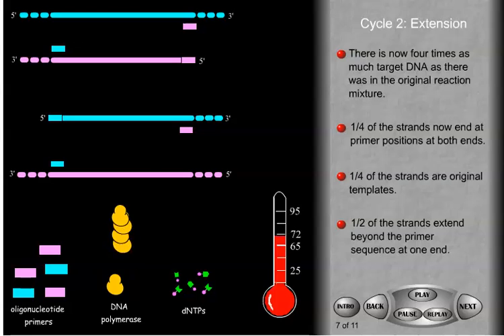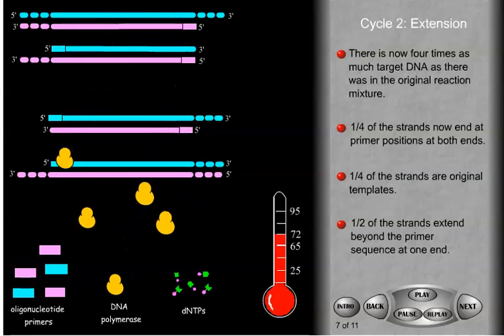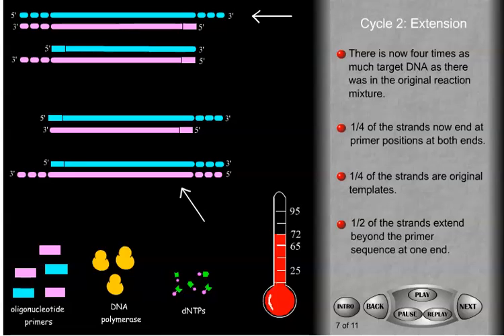With the completion of extension in the second cycle, there is now 4 times as much template DNA as we started with. Although the original template is still present, the majority of the DNA in the reaction has been newly synthesized. Strands which used previously synthesized strands as templates are of defined length, because the polymerase ran out of template when it reached the end of the oligonucleotide. The length of these strands is the distance between the 2 sequences in the original target DNA, corresponding to the sequence of the oligonucleotides.